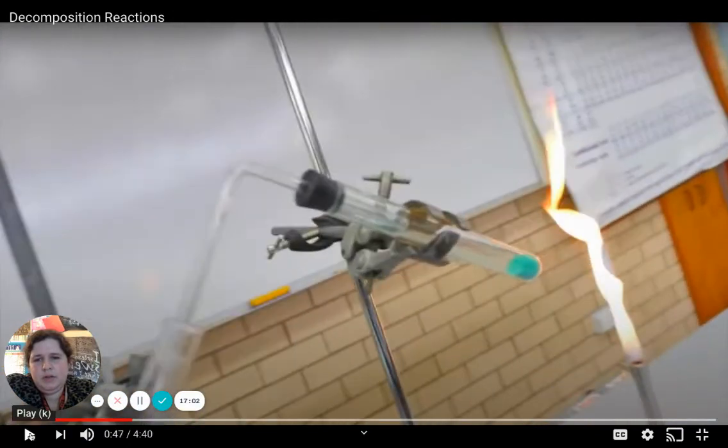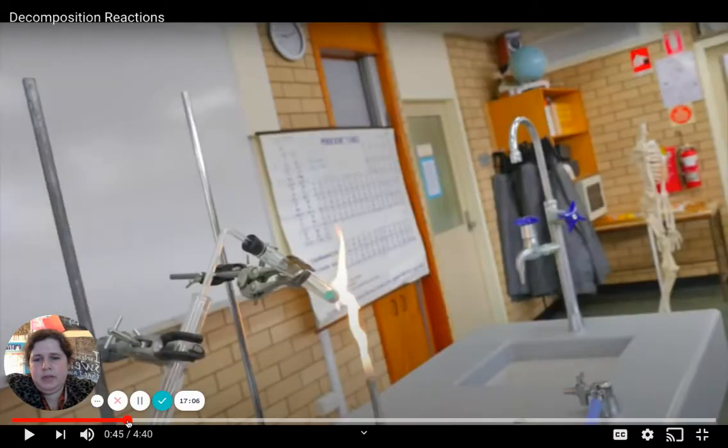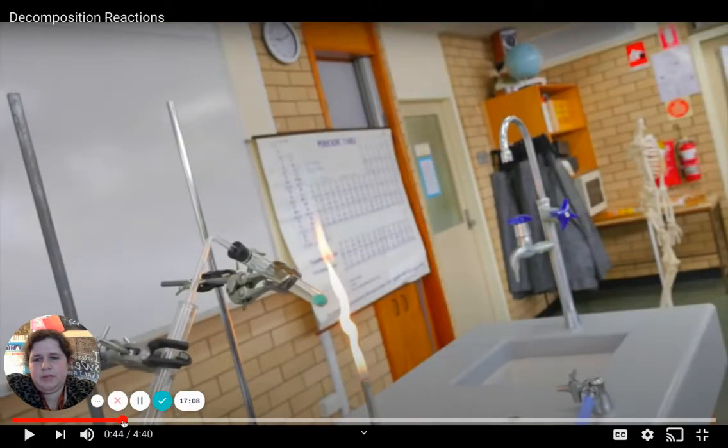Okay, so here let me explain the setup that he's got here, because these are some instruments that we've probably not seen before. Here we have two ring stands, and what they've done is they have clamped on a test tube holder.